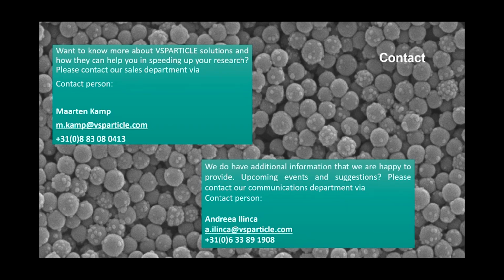Yeah. And another quite long question from an anonymous person. There is a category of materials known as high entropy alloys, which are a combination of 5 or more than 5 metallic elements in equiatomic ratio. I'm very proud of myself. Can this instrument be used to make nanoparticles of such materials? Are the electrodes available for such complex alloys? So my simple answer would be yes.